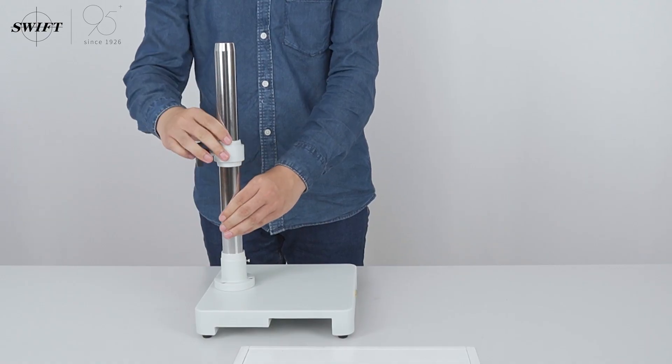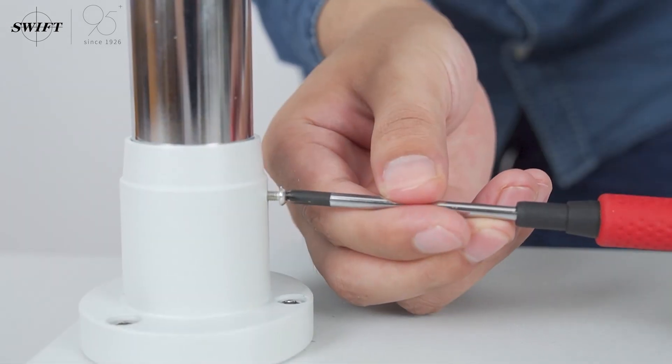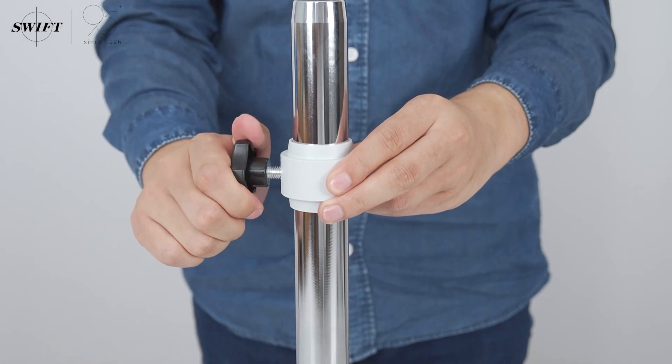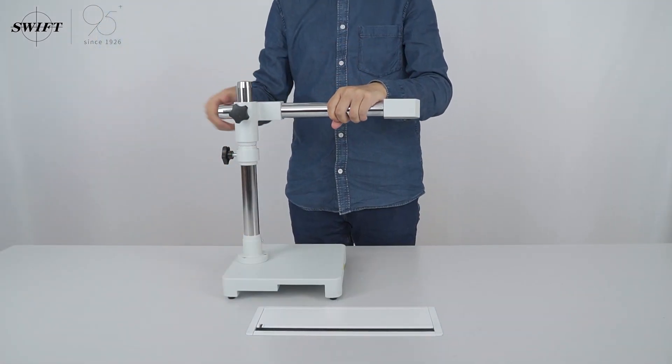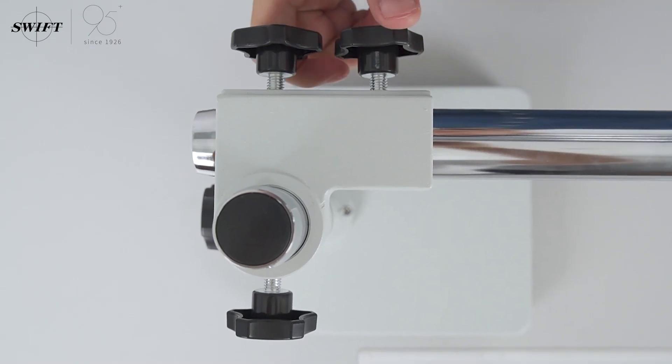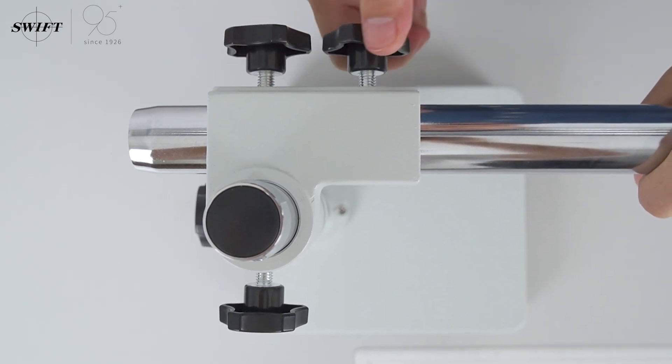First, screw the vertical column into the base and tighten it with screws. Adjust the safety support frame to a suitable height and tighten it. Insert the hole at one end of the horizontal column into the vertical column and tighten the column locking knob. Adjust the position of the horizontal column extension or retraction for convenient observation.